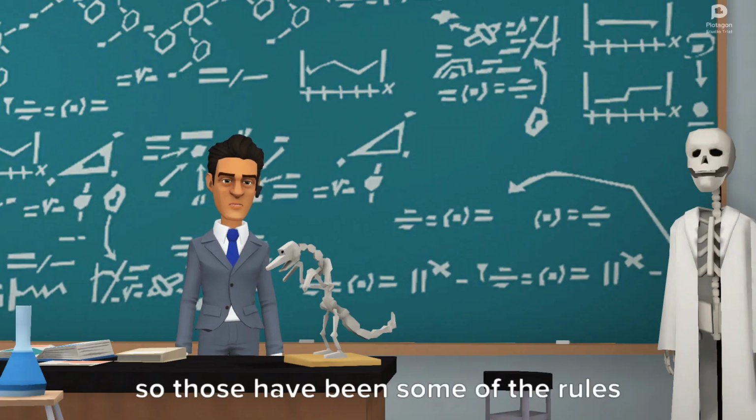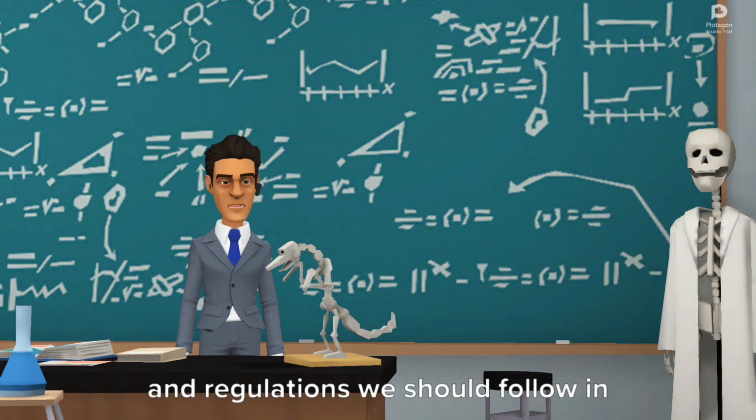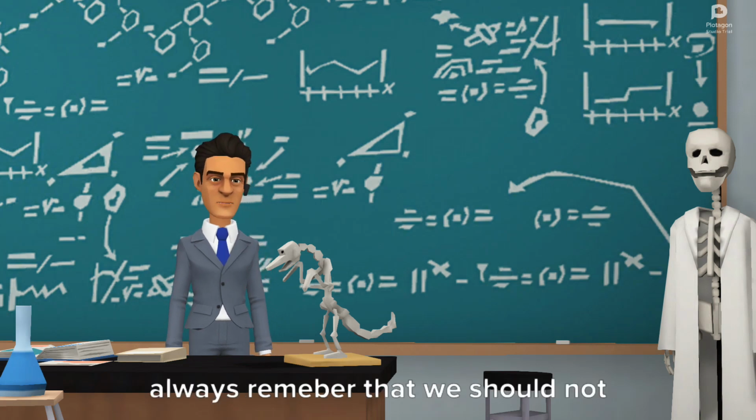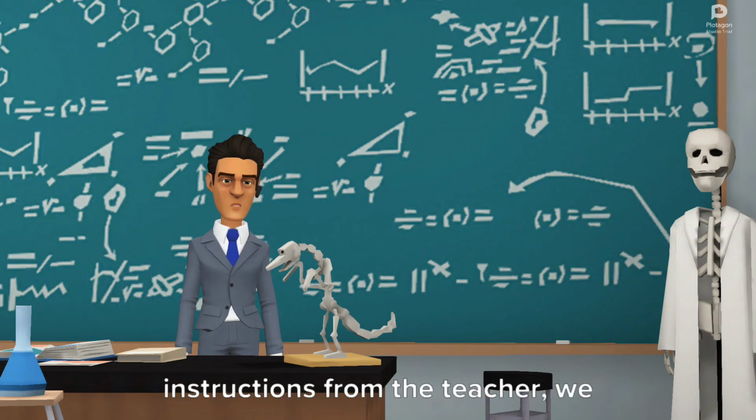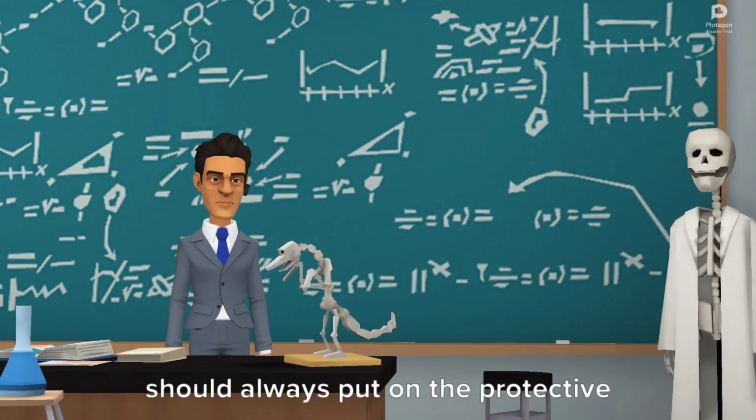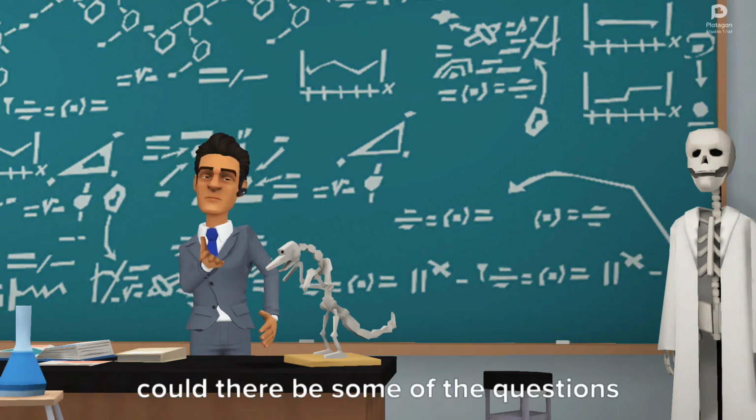Exactly. So those have been some of the rules and regulations we should follow in the laboratory. Always remember that we should not perform any experiment without the instructions from the teacher. We should always put on protective gears.